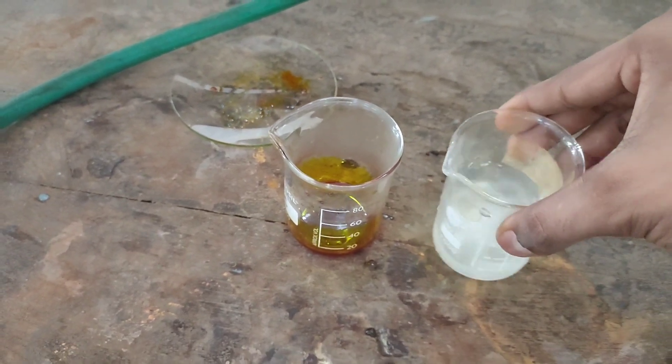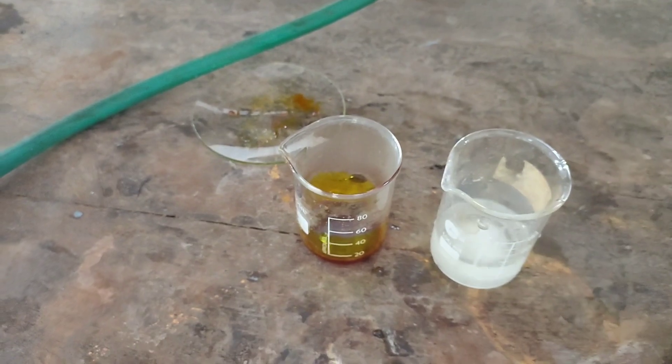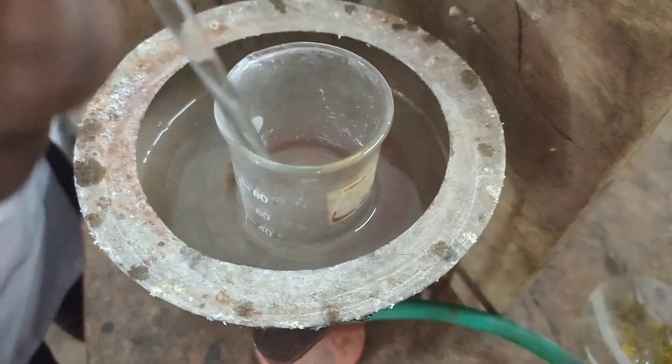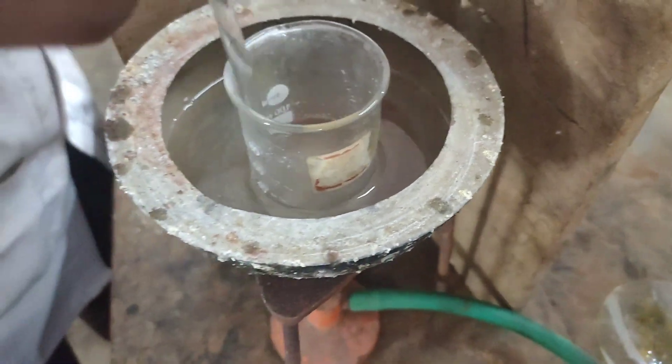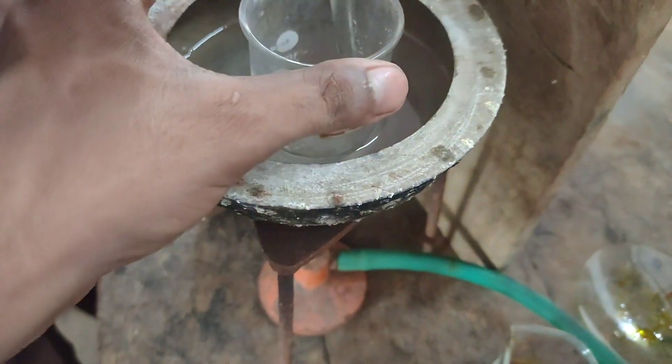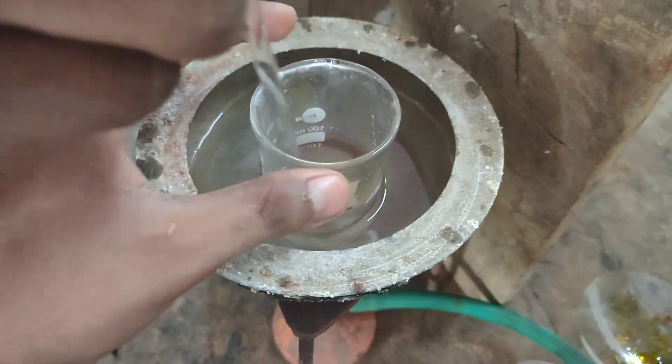Dissolution of potassium oxalate in water was endothermic and the solution cooled down. So, to dissolve the potassium oxalate, the solution had to be warmed. I took the beaker and heated it in a water bath, and stirred it with a glass rod until all the solid dissolved.